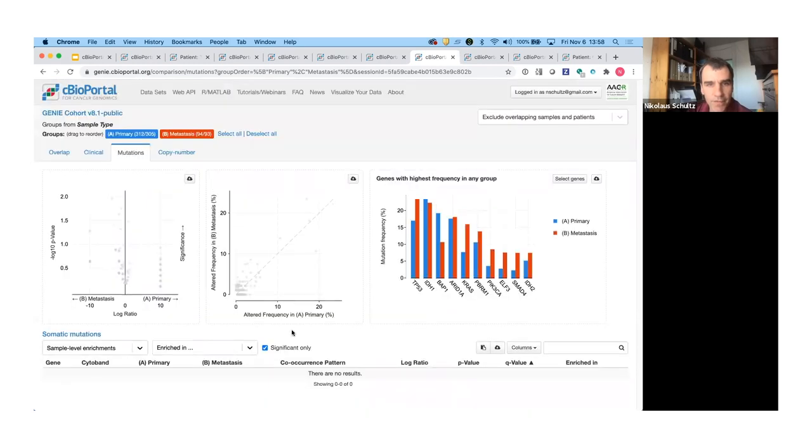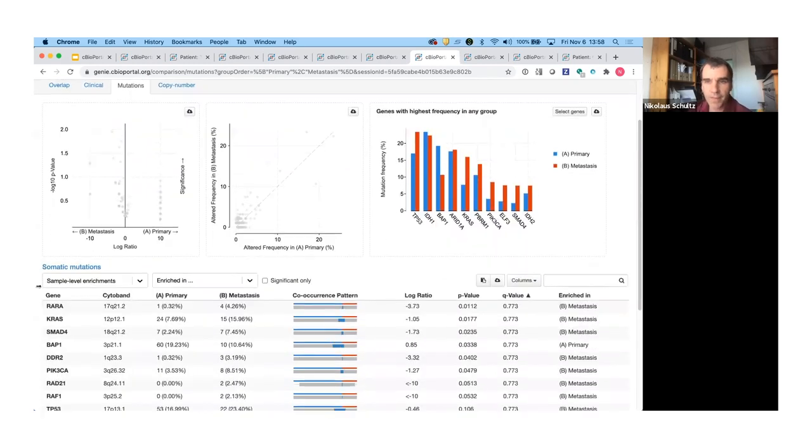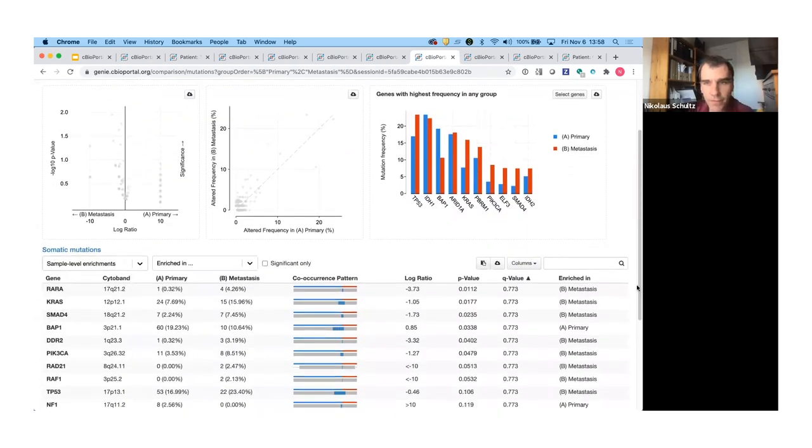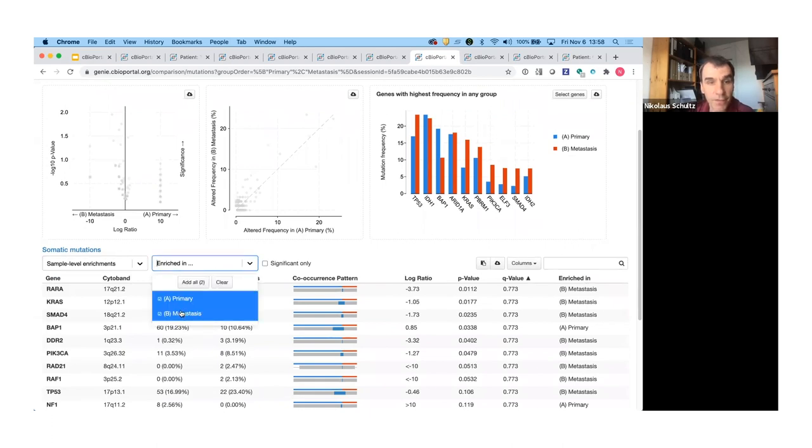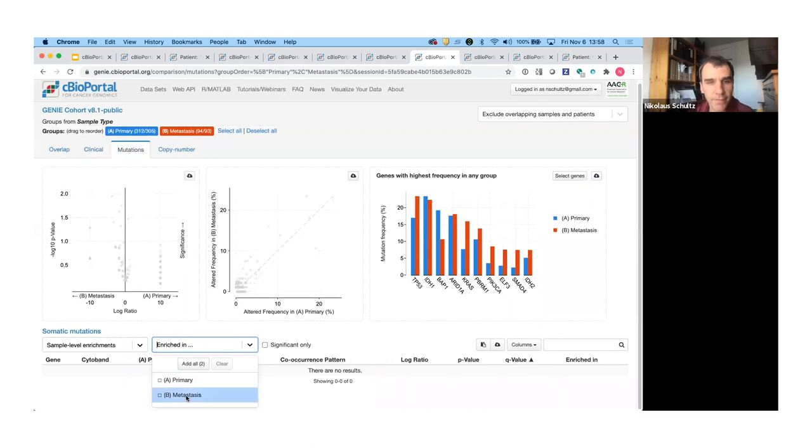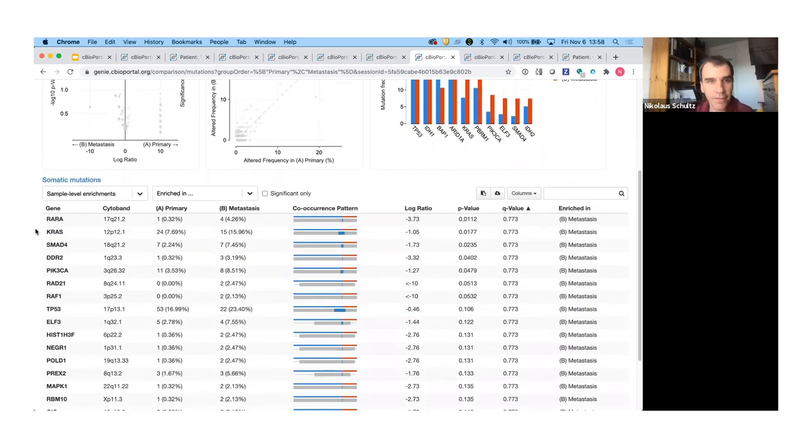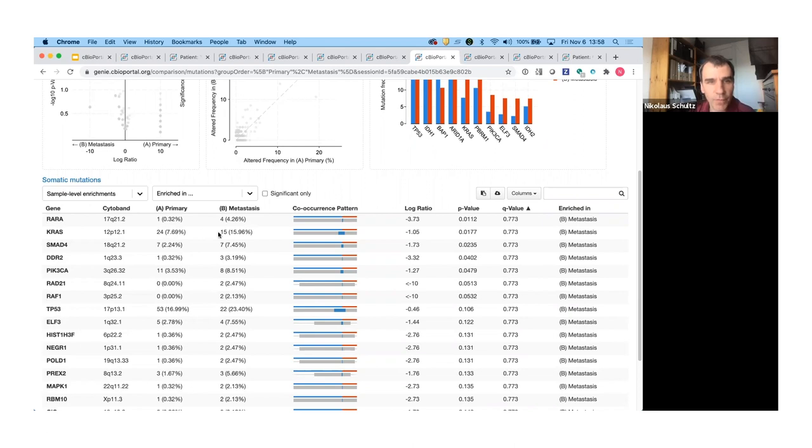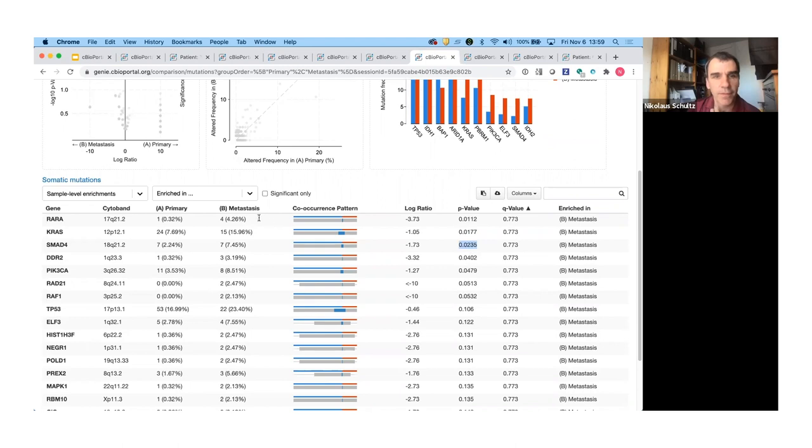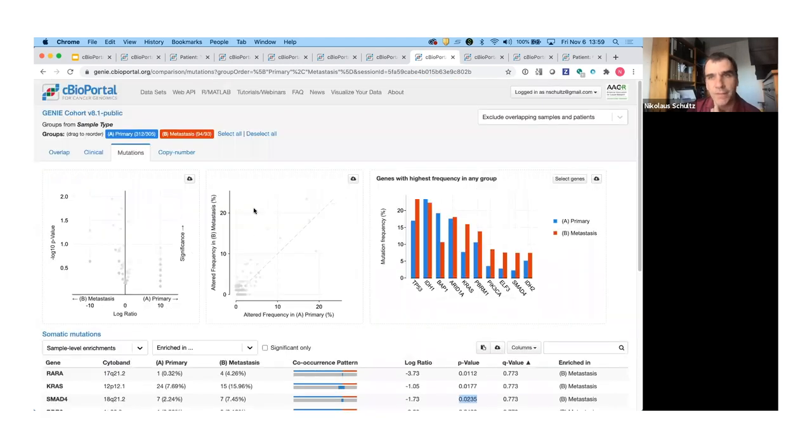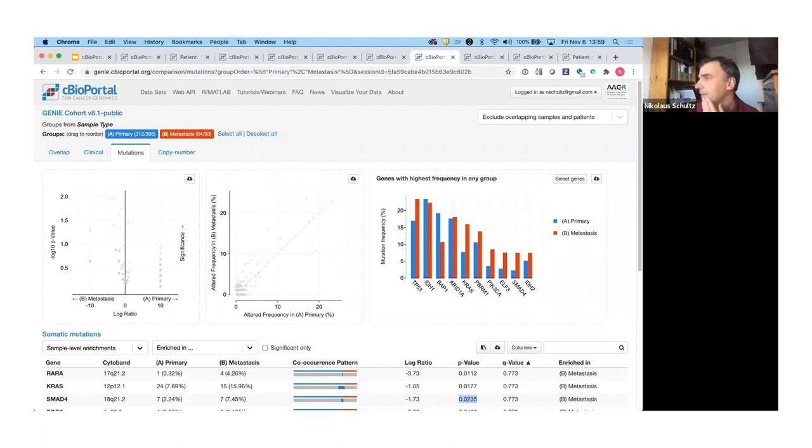If you wanted to ask are there any differences here between primary and metastatic tumors, you can compare those two. I'm teaching you how to add a chart back in. I can hit compare on this and what the portal does is it takes the two groups and simply compares them with respect to any available clinical parameters. Sample type will show up, but for example, fraction genome altered now shows up. If you want the primaries on the left, you can drag it over. To me, maybe somewhat surprisingly, the primary tumors have a slightly higher degree of copy number burden as measured by FGA. Nothing else is significantly different. Mutation count is roughly the same on average, but in mutation space and copy number space we can look for differences now.